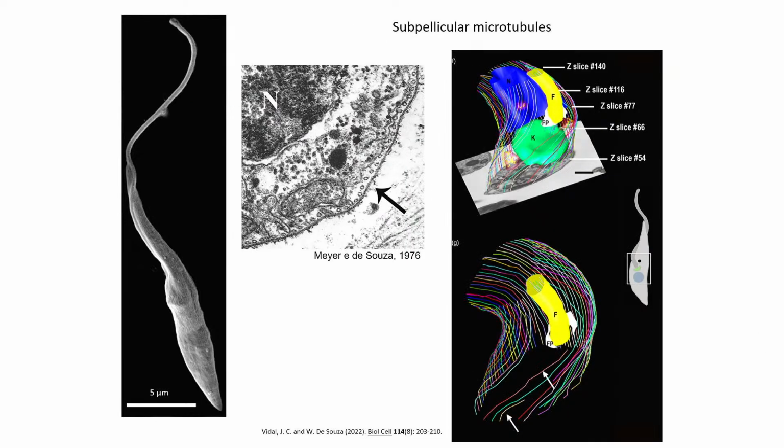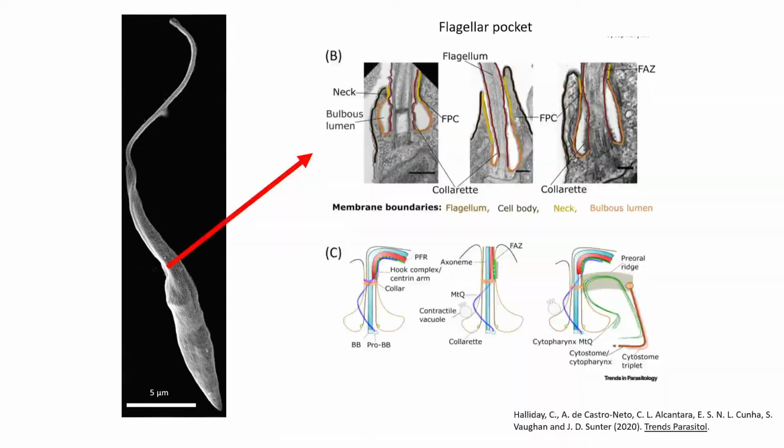And these cells also have a cage of microtubules that are positioned below the plasma membrane. They protect the cells, and they are responsible for these different morphotypes. So you can see here a layer of microtubules below the membrane, and here a more recent work of our group where we show the arrangement of these microtubules and how they are positioned, and it starts during the cell morphogenesis.